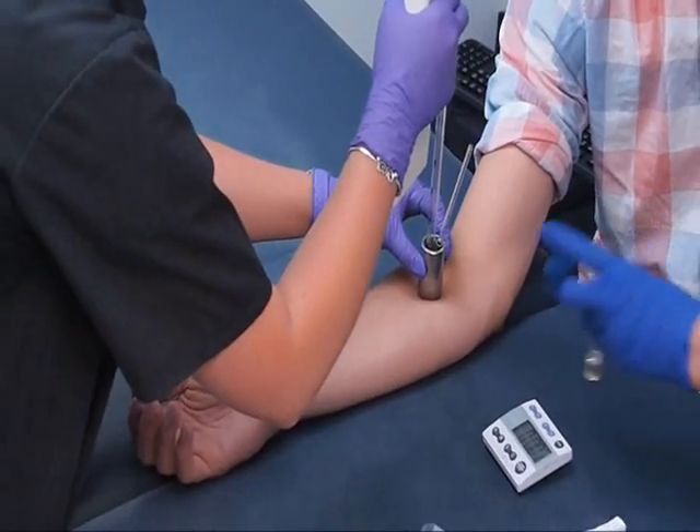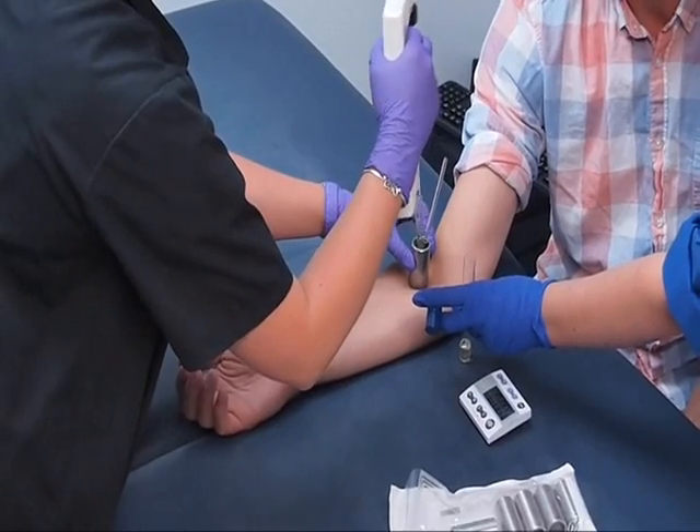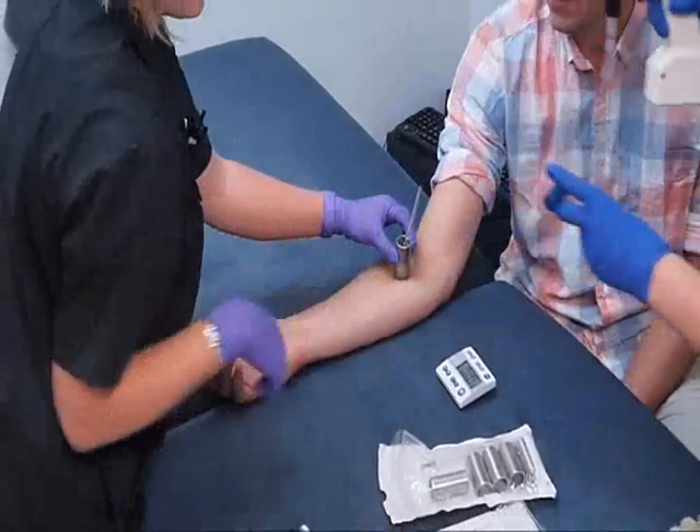The sample is removed from the cylinder using a sterile pipette and placed into the same test tube containing the first sample, pooling the samples.